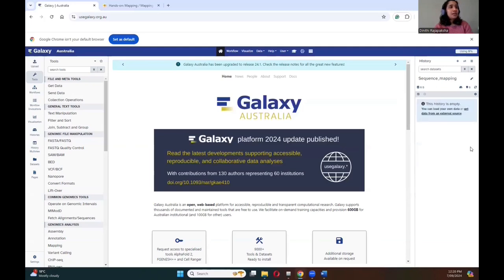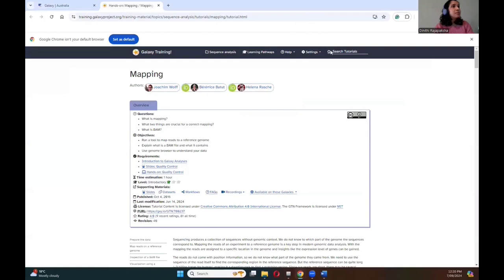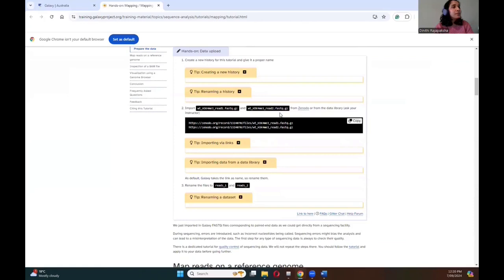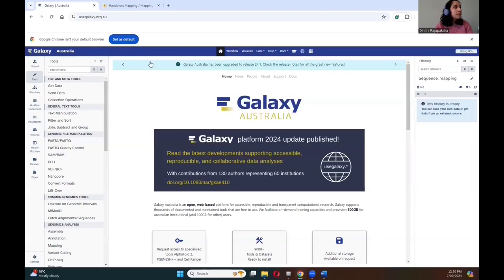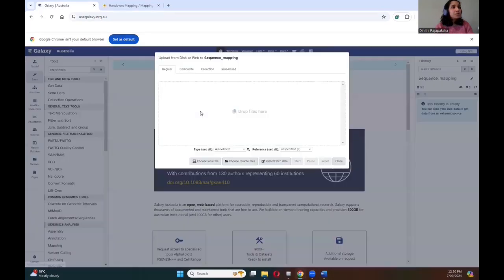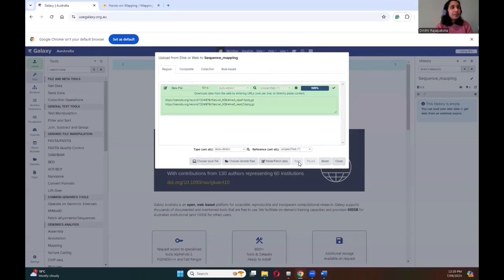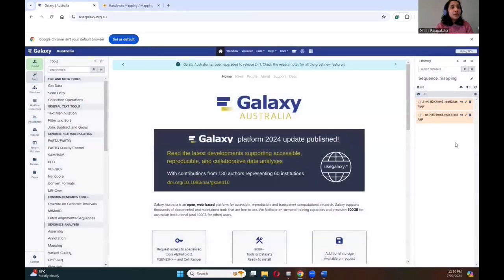Now we need data. Data for today's tutorial will be from Zenodo and links for the datasets are given in the tutorial. All you have to do is copy the two links and then using the upload option select paste/fetch data, paste the two links you copied from the tutorial, and hit start. Once it reaches 100% we can close this window and the two datasets will appear in the history panel. They are still loading — once they turn green we are good to go.